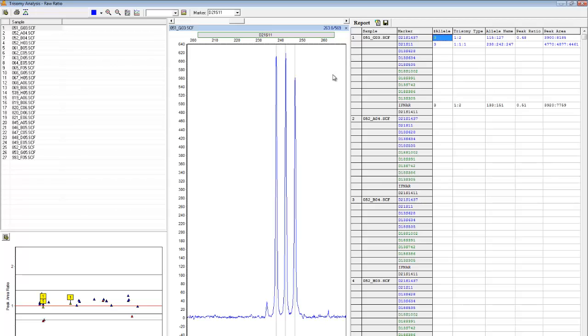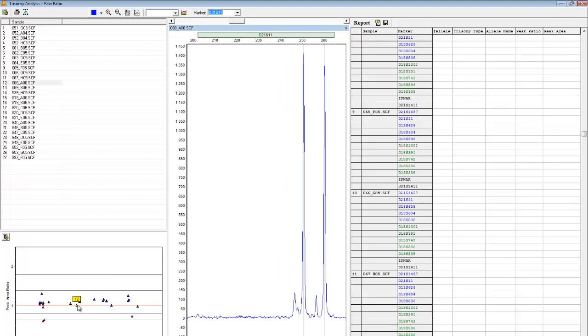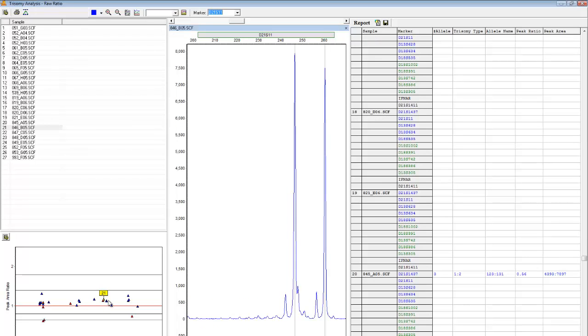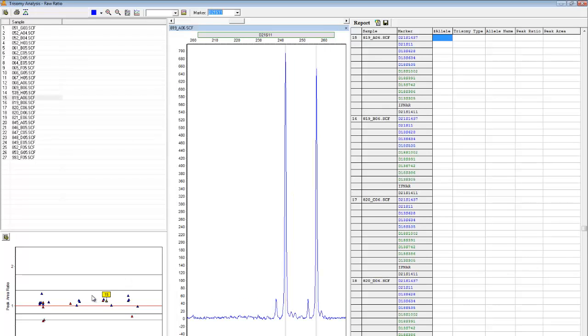The results can also be visualized using the ratio plot in the bottom left. Each data point on this graph represents the peak ratio of a sample at the selected marker. For example, here we're looking at marker D21S11, and you can see that each of these points that I select is associated with a different sample.